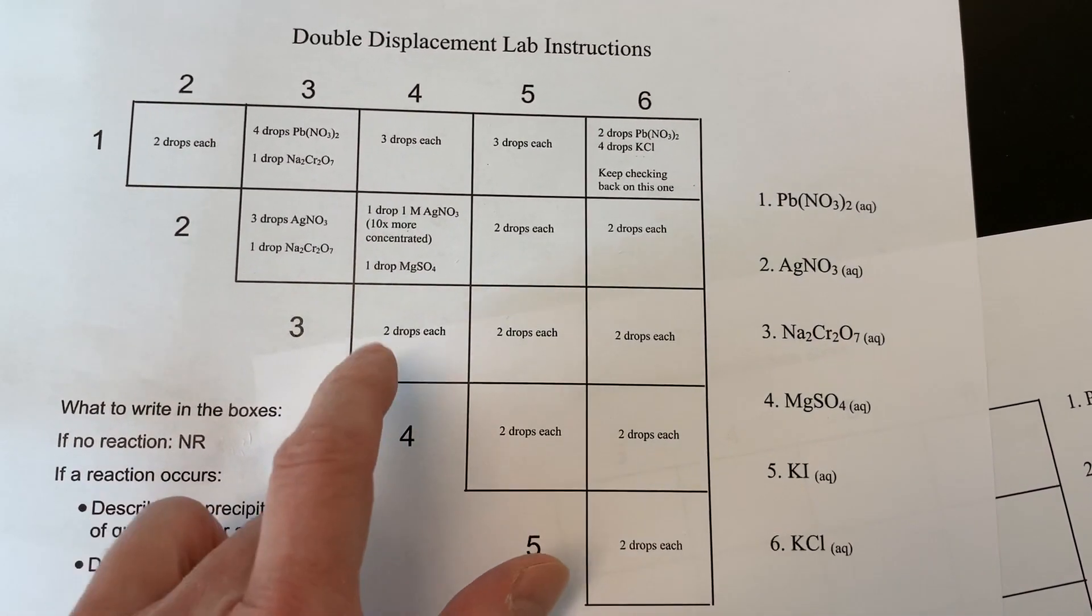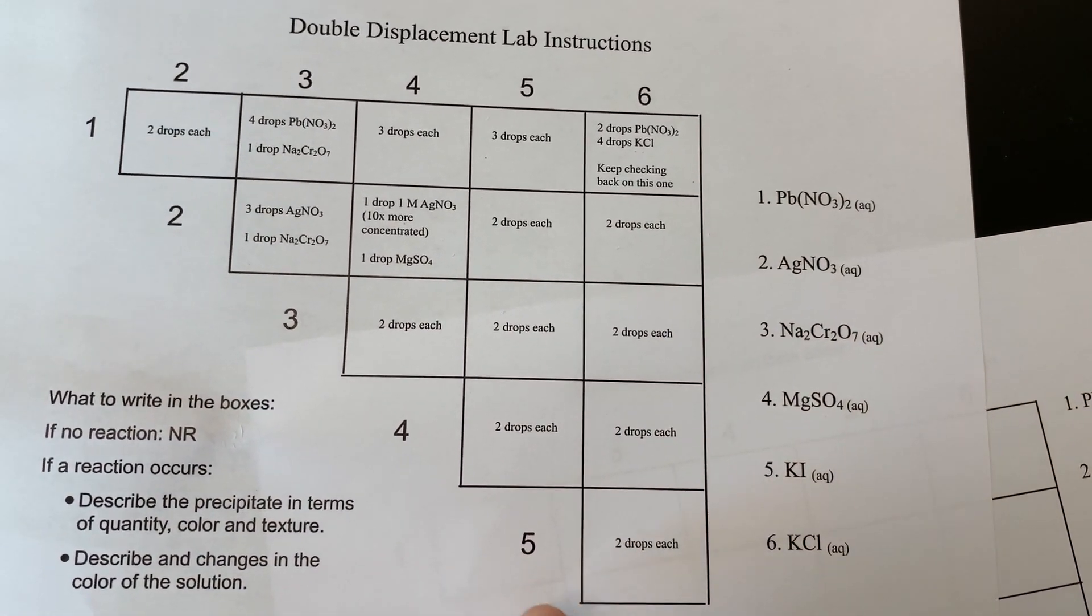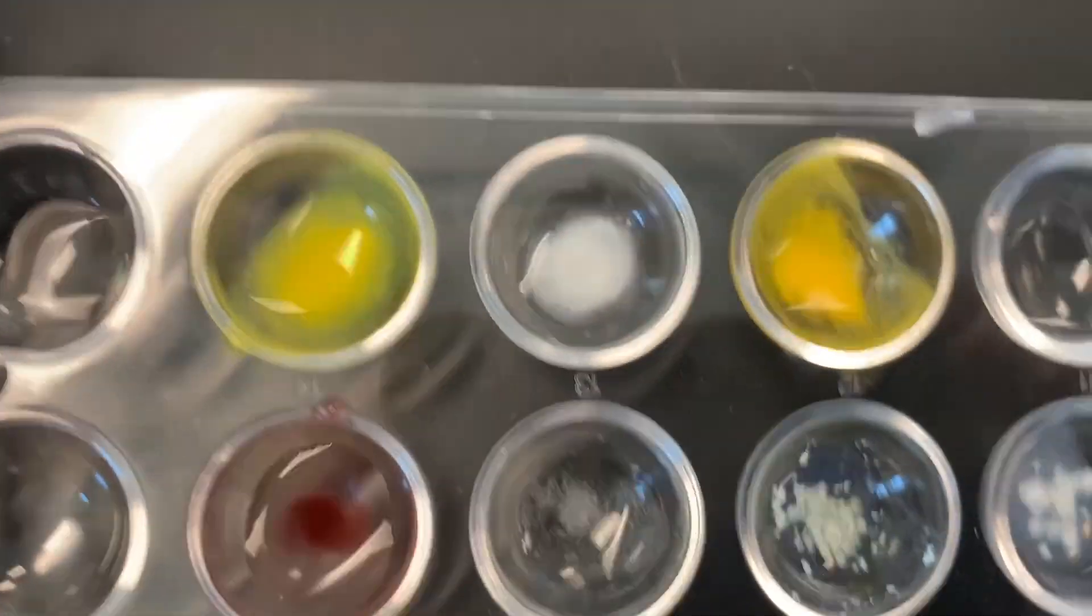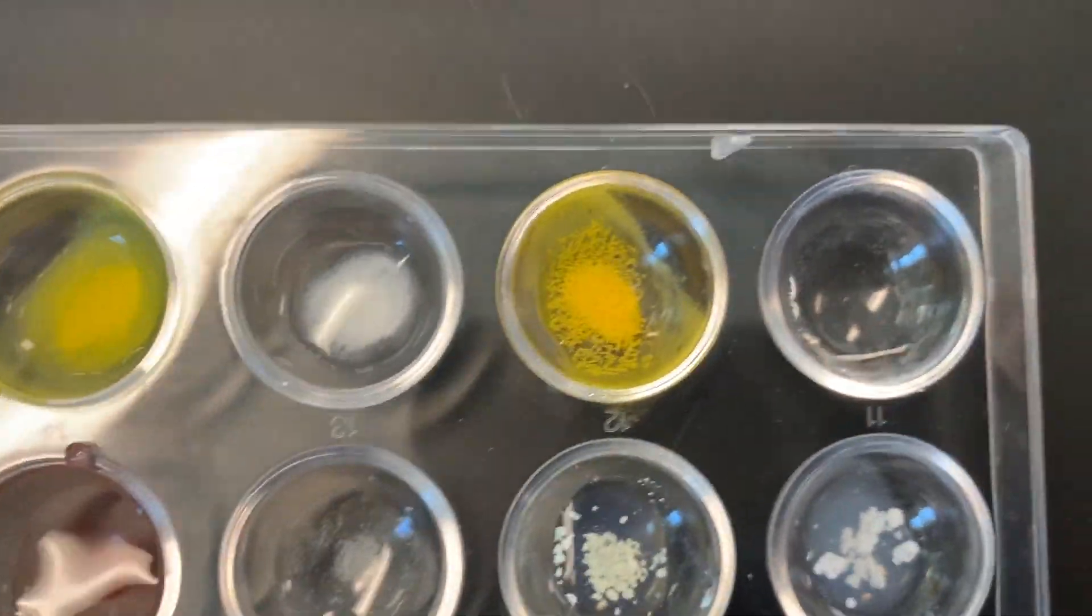To save some chemicals, I'll just say that none of these actually produce a reaction. Now use your data sheet to record your observations of the results of each reaction.